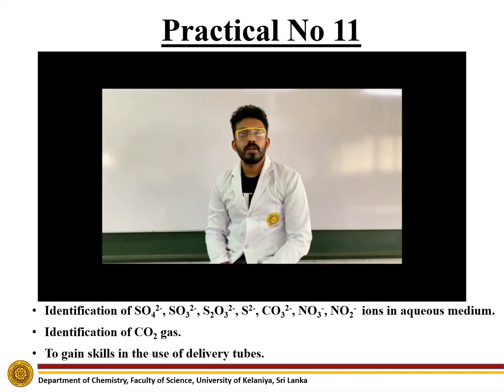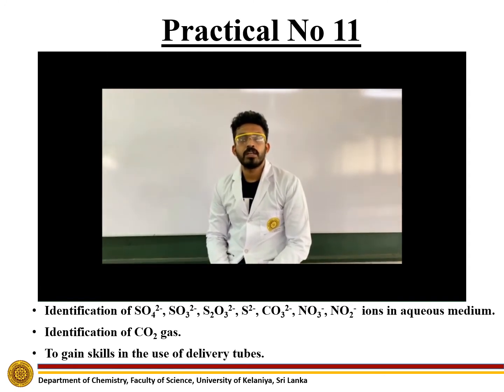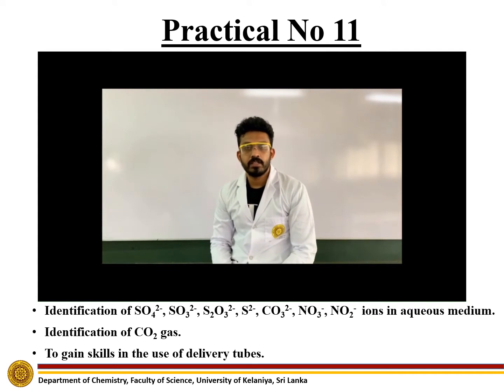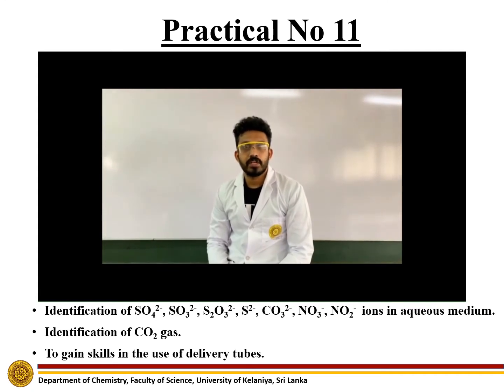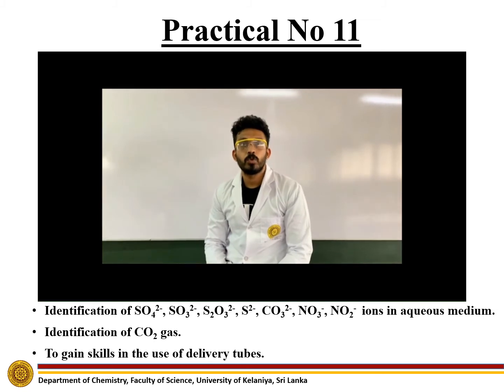Objectives: identification of sulfate, sulfide, thiosulfate, sulfite, carbonate, nitrate, and nitrite ions in an aqueous solution. Identification of carbon dioxide gas to gain skills in the use of delivery tubes.